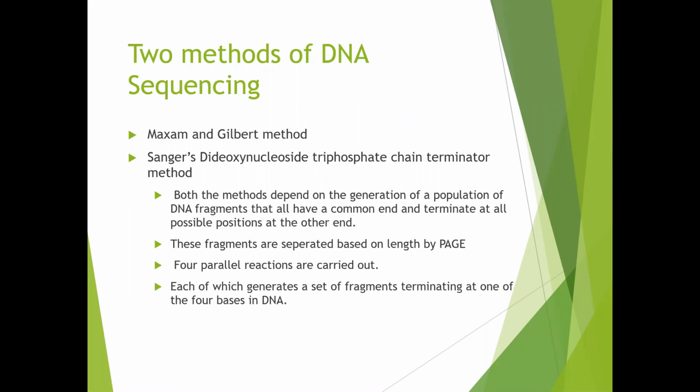Now let's concentrate on the 2 methods of DNA sequencing which are available for sequencing the given fragment of DNA. The 2 important or basic methods are the Maxam and Gilbert method, and the second method is Sanger's dideoxynucleoside triphosphate chain terminator method. These are the two methods.